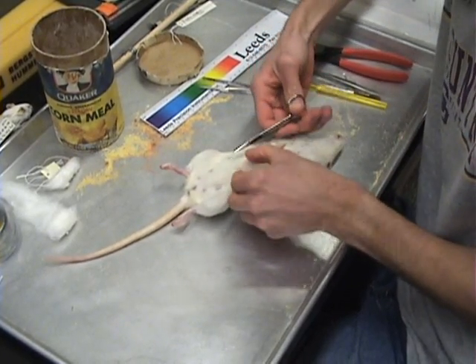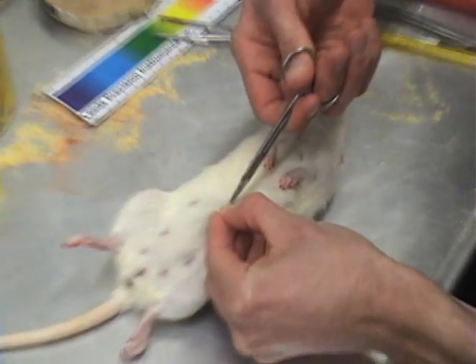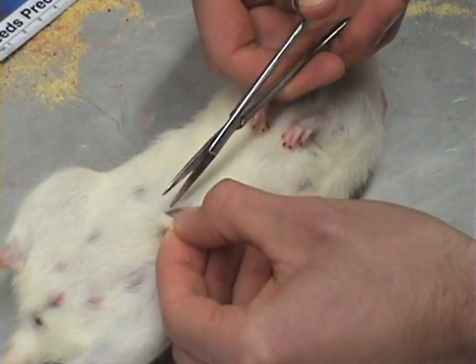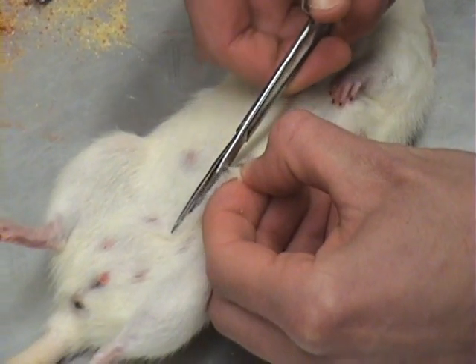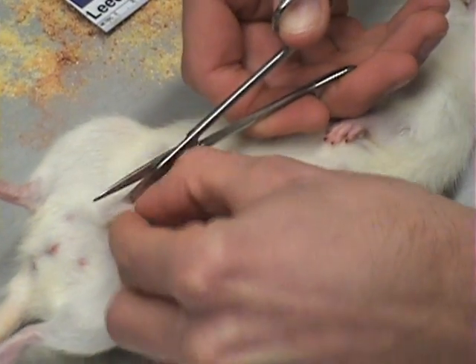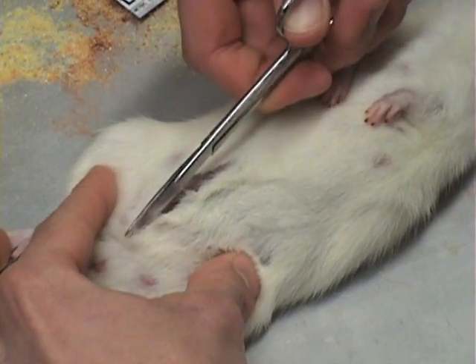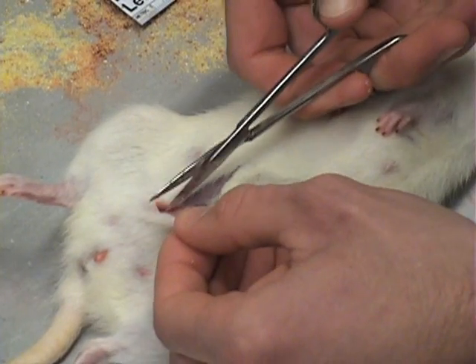Begin by making a small slit mid-ventrally. Once a small slit is made, gently insert the scissors and begin to cut the skin down towards the tail. Be sure not to cut any visceral muscles. Work around the nipples and make sure not to cut through the genitals. If the genitals are in the way, cut around them.